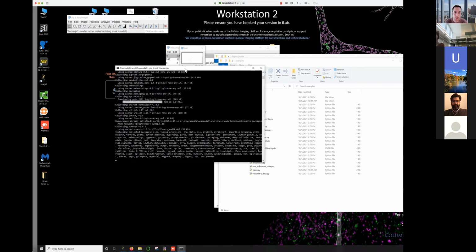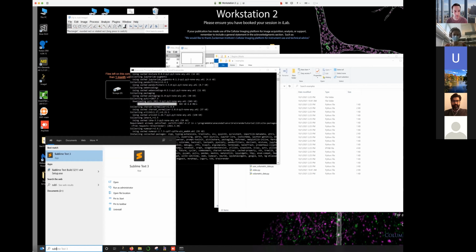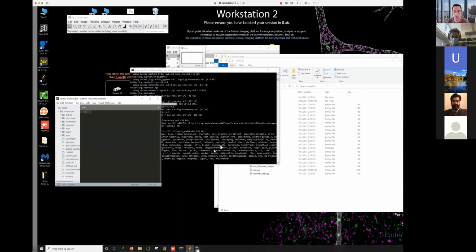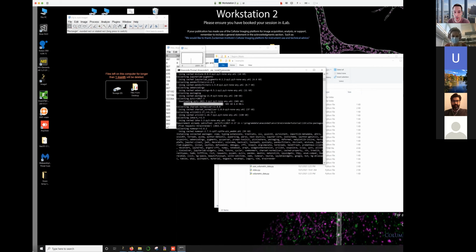So one good alternative that I often use is, there's many ways to work in Python, but one program that's quite nice to work with is Sublime. This is just an editor, so you can edit the scripts in here and then run them from your BrainRender environment, and that's a nice way of being able to script easily and then run without having any issues with Spider. But with PC, there doesn't seem to be an issue with installing Spider.